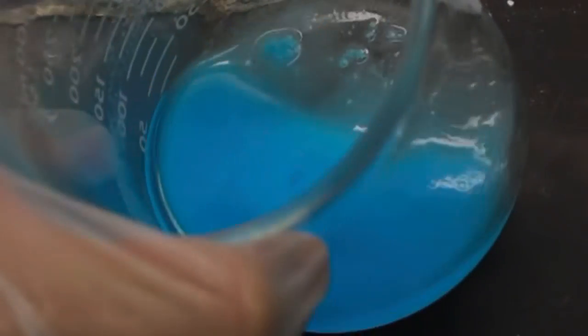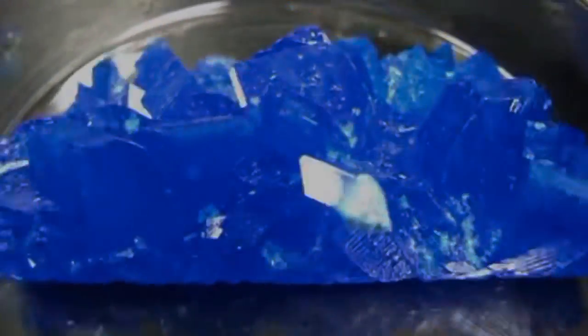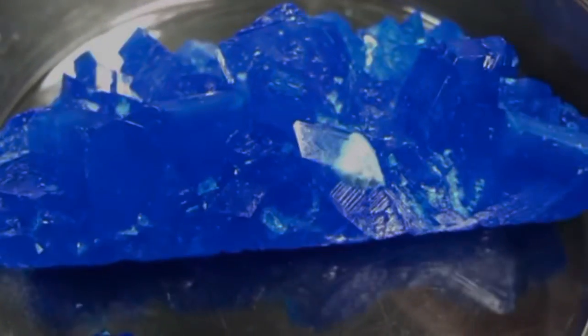If you want very large crystals, just let the mixture evaporate instead of boiling it, and eventually you'll get these nice large crystals of copper sulfate. We'll be using copper sulfate in upcoming videos.